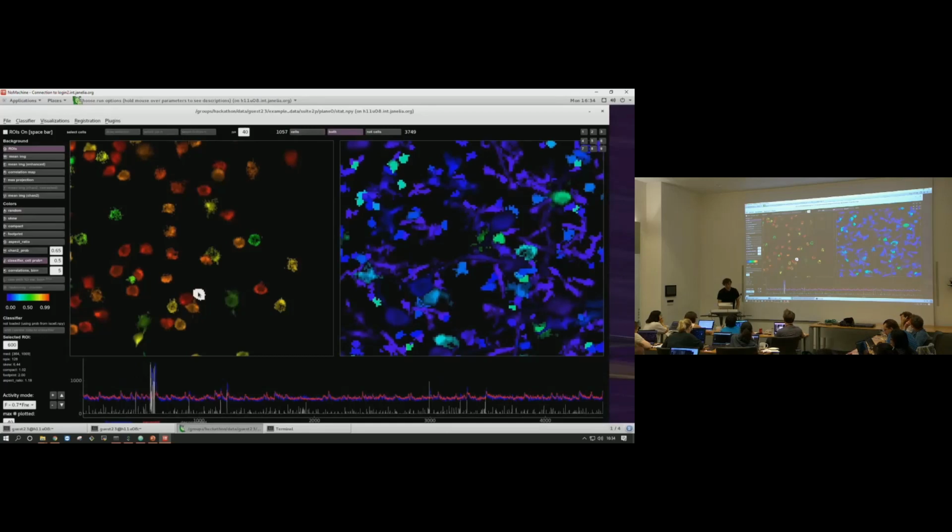I think if it's super high, it's usually like maybe this one. Let's see. This is like 6. Skewness is the thing that measures how often you get outliers. So the most skewed trace would be one that's perfectly flat and is just on one time point. That would give like skewness 100 or something. So basically, the higher it is, the more it means that you have relatively few of these big amplitude events, which is the kind of statistics you look for in your cells.